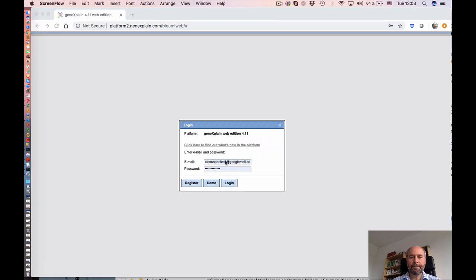Hello everybody. Today I will be showing how to edit workflows in the geneXplain platform.